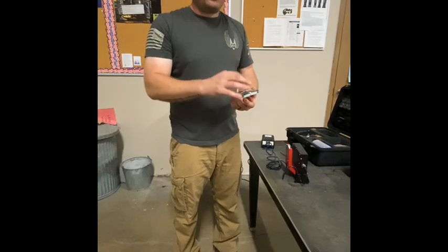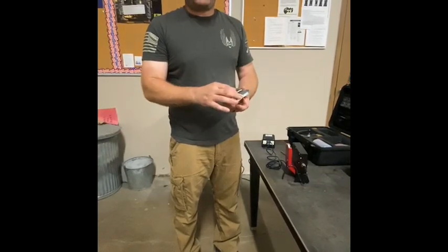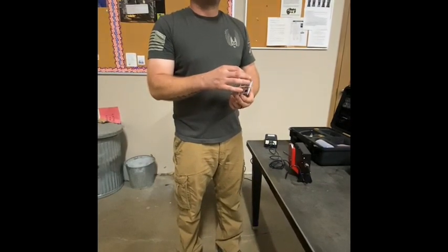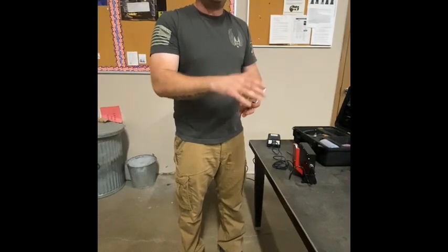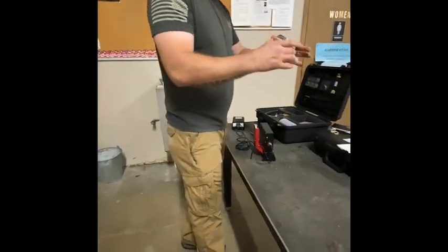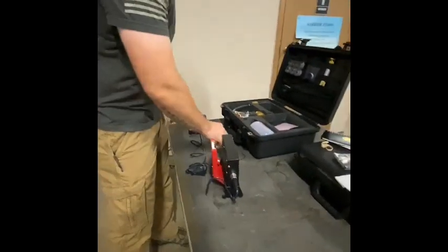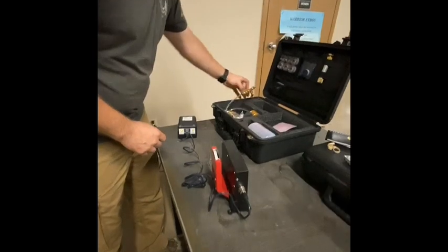Anyway, before you use the pad, do a visual inspection. If there's any damage to the pad, if there's discoloration in the dye, if it is not just a solid, consistent yellow color, you don't want to use that pad. So you would open this pad up using the tweezers. You would put it in this.